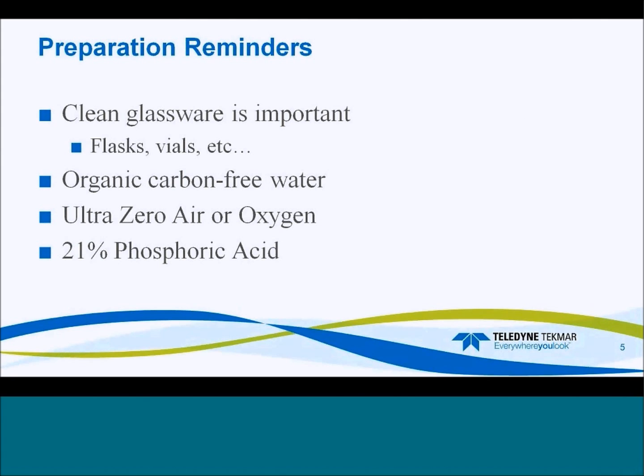Just some things to remember before you start calibrating or even taking in samples is that everything needs to be clean of other contamination. So it's important to clean the glassware that's on your TOC unit, and that would be the mist trap, the IC sparger, and that also includes the 40 ml VOA vials that you put your samples in. Not only should everything be clean, but also new septa on the vials.